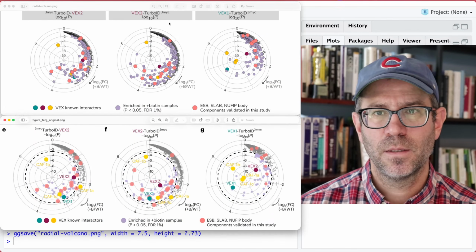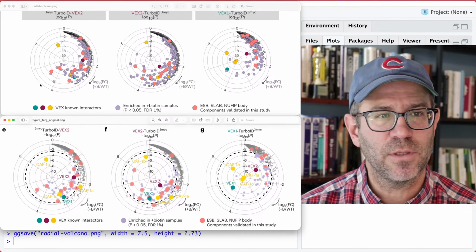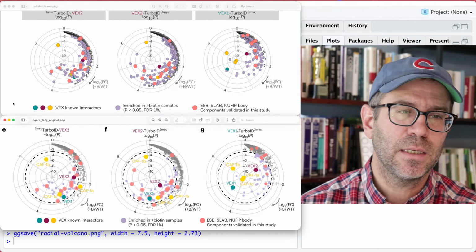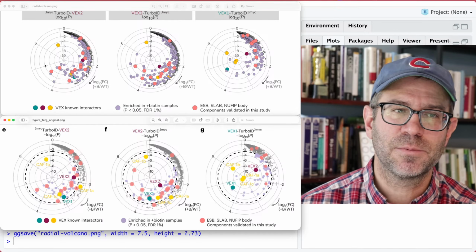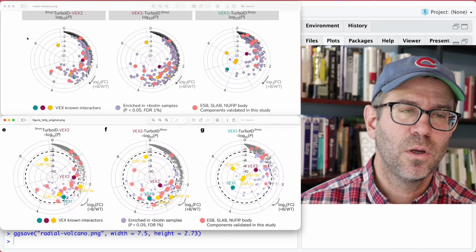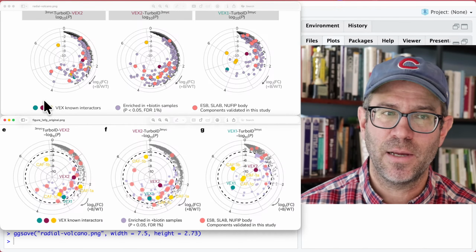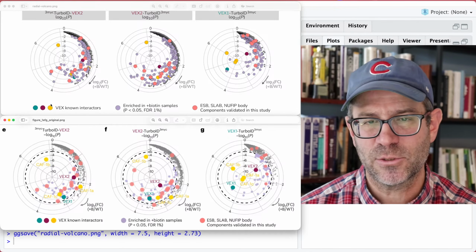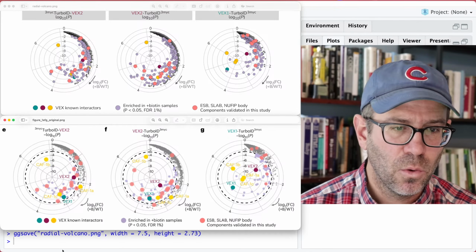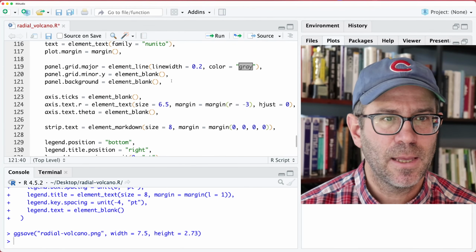There we go. And so it appears like we have big margins on the left and right. And that is because, why? That is because this is a special version of coord_equal, where the size of one unit on the y-axis is the same on the x-axis. And so to get the aspect ratios right, it looks like there's extra padding on the sides. So whatever.